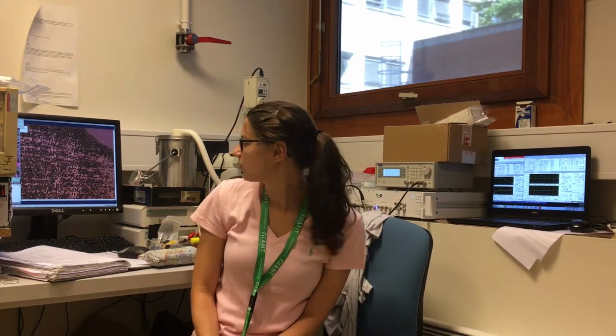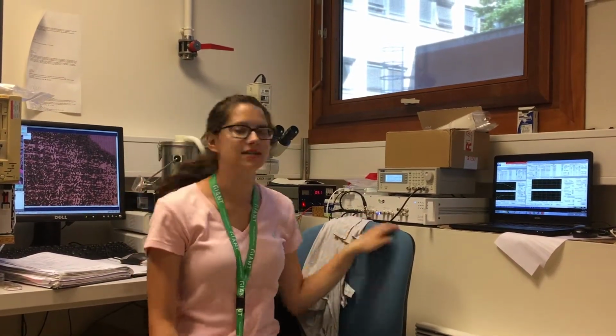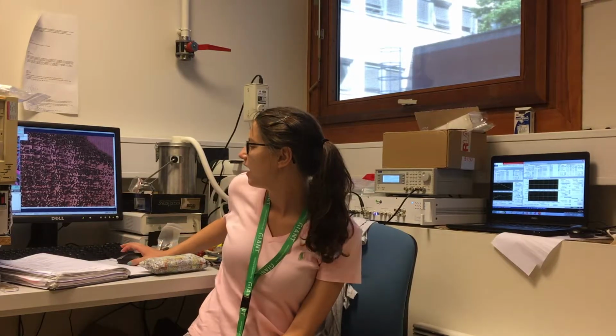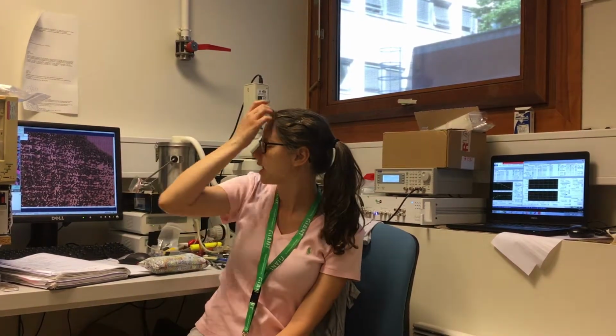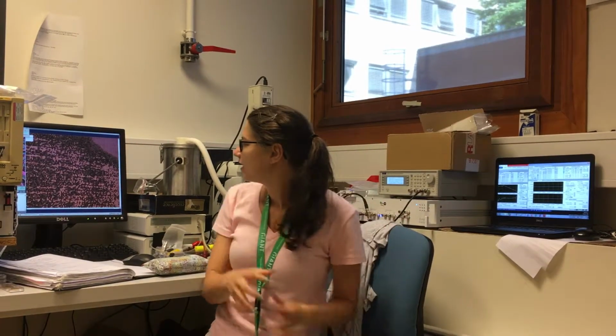Hi, I'm Alyssa. I'm part of Act 3, and I'm going to tell you a little bit about what I've been working on. So right now I'm using a polarized optical microscope, as you can see here, and we're looking at a sample of 5CB in an in-plane cell. So we're able to add an electric field. The cell is wired up here, and we can apply different electric field strengths and sort of measure the response of the liquid crystal and see if the application of an electric field is affecting how the particles orient themselves or just how they can be controlled.